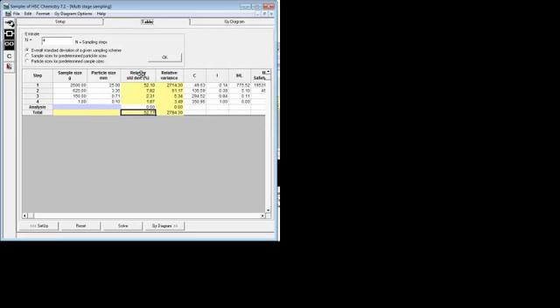We get back to the table, and now we change the problem so that we change the sample sizes, because our available equipment, jaw crusher, swing mill, ring mill maybe, will give these particle sizes. So we don't want to change the equipment which we have. We want to only adjust these sample sizes. That's why we change the problem so that we estimate the sample sizes for given particle sizes.